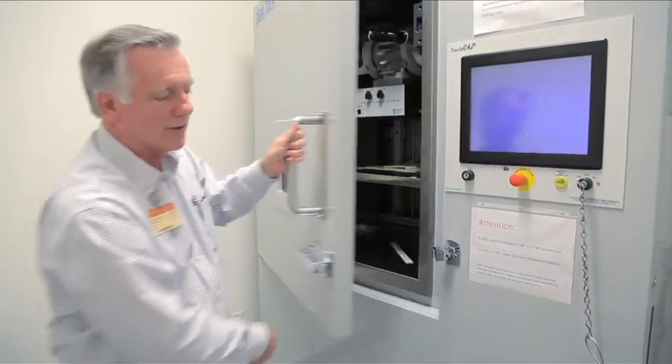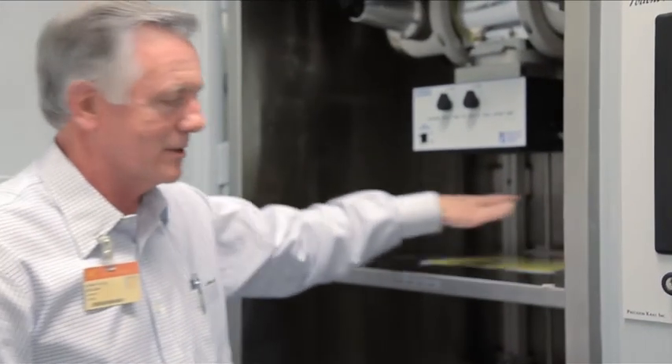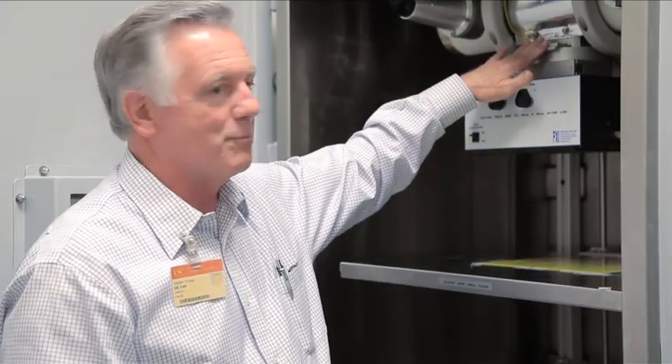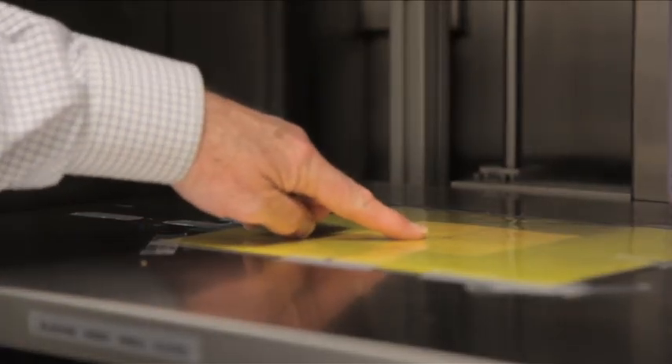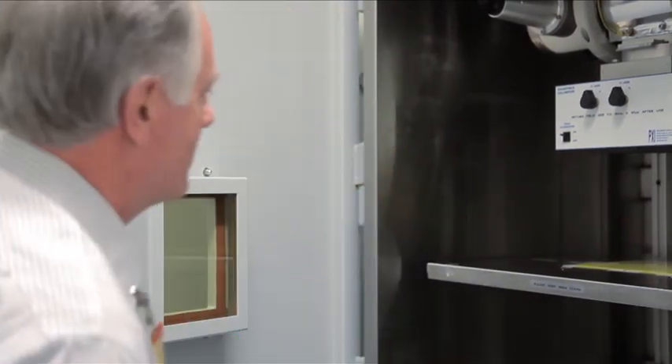After you use the machine, it's good to return it to the way it was when you arrived: clean, filter in place, and the right size field, which is 10 by 10. If you are using a special field or a special position, please put it back to the standard set of conditions. At that point, you're pretty much clear.